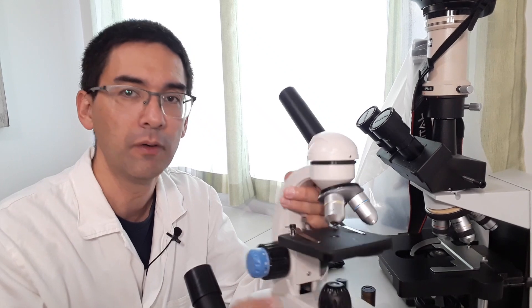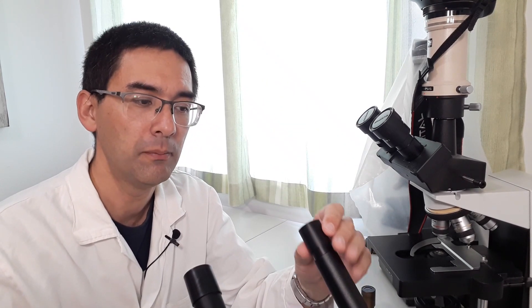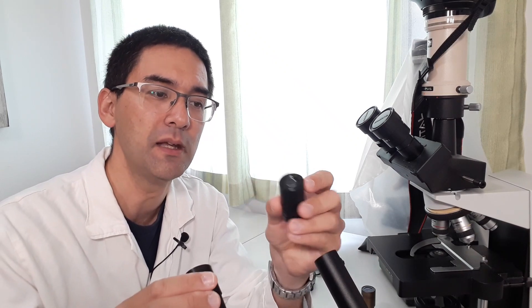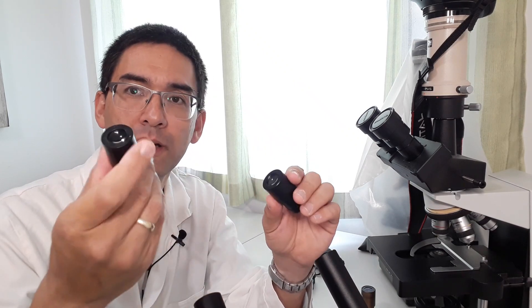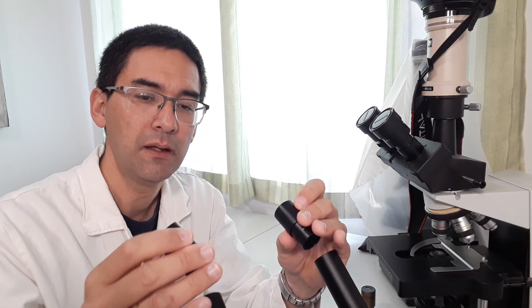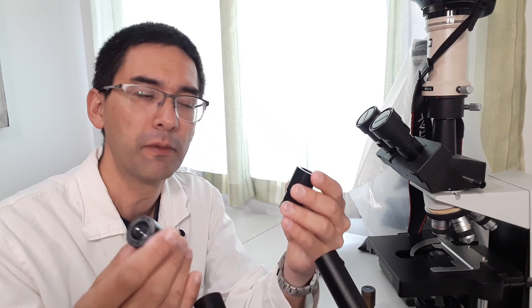Now to some more differences. The supplied eyepieces of this microscope, of the SS110, I think they are a little bit better. The 10x eyepiece is a full metal eyepiece, while the other one from the Telmu is plastic. That itself would not be so much of a problem, I think.